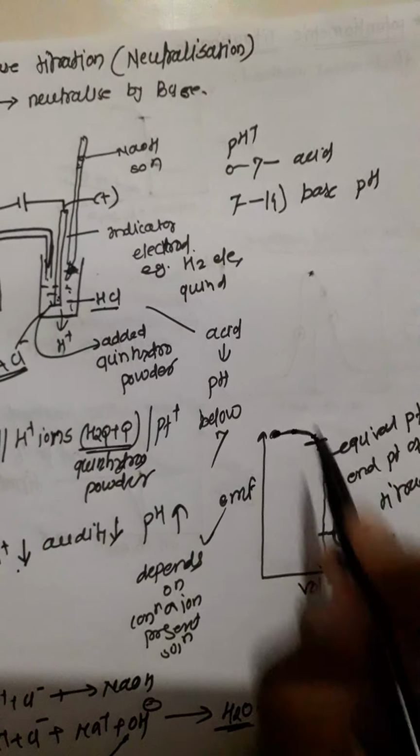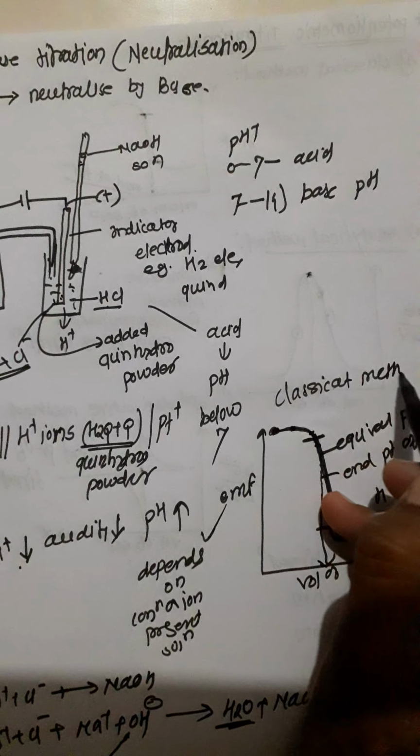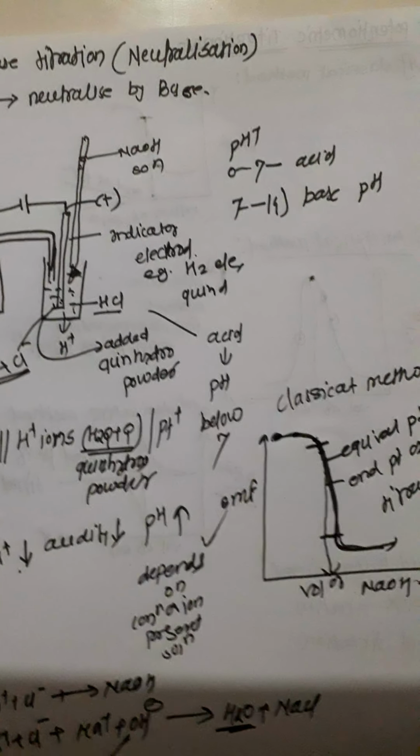This is the classical method to determine the end point of titration.